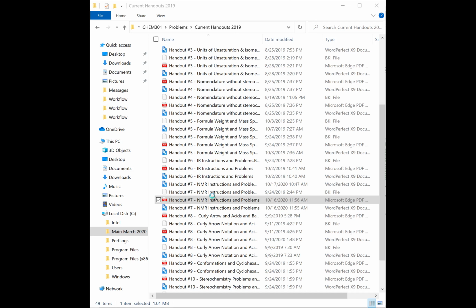Okay. All right, if you have disubstituted and they're the same, notice the A and the A are the same. That plane of symmetry goes right there. And so A is only going to be a doublet for 2 hydrogens. Okay, equivalent hydrogens do not split each other. Do you notice the B and the B? Those are identical to each other. And so they're not going to split each other. So the only one that's going to split it is its neighbor. So that's a doublet for 2 hydrogens. Okay, and that's what I'm talking about, a doublet of doublets. You would see something, not quite that pretty, but you would see that nice symmetry in your proton NMR.